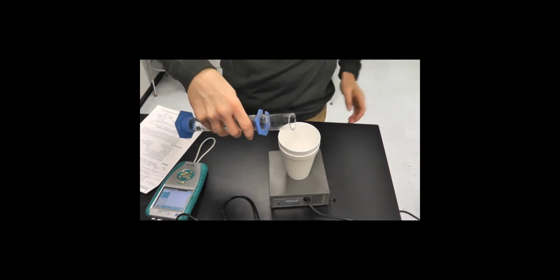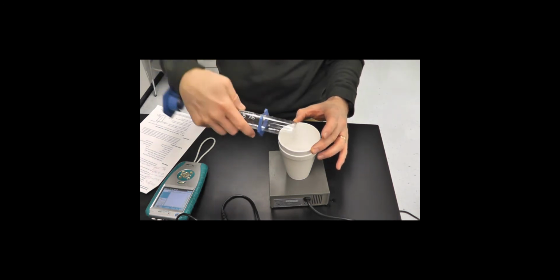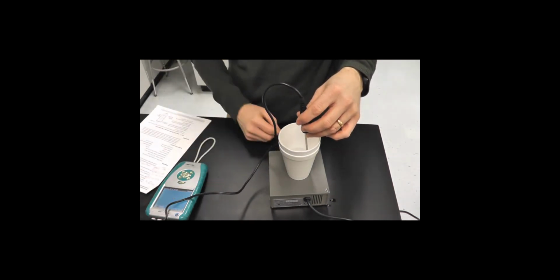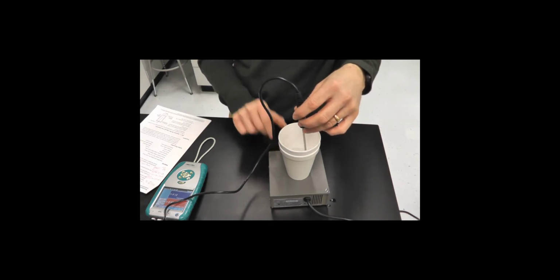Next, measure 50 mils of distilled water into a 50 mil graduated cylinder. I'm going to stick this in here and get this temperature real quick. So I'll start stirring it. And this temperature, it looks like, is 21.5 degrees. 21.6, 21.5, right around there. So I'd put that in data table 1, my initial temperature.